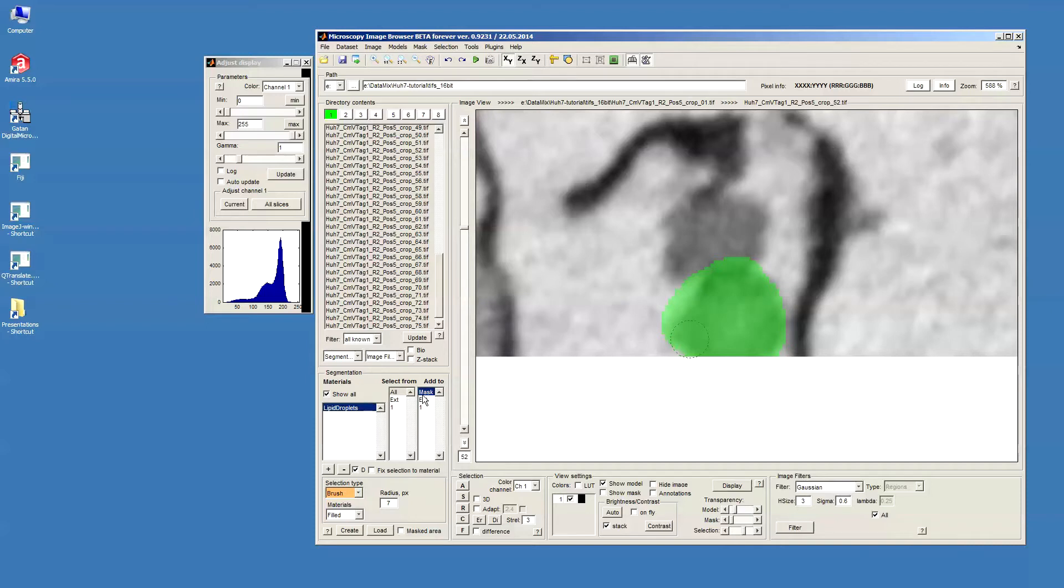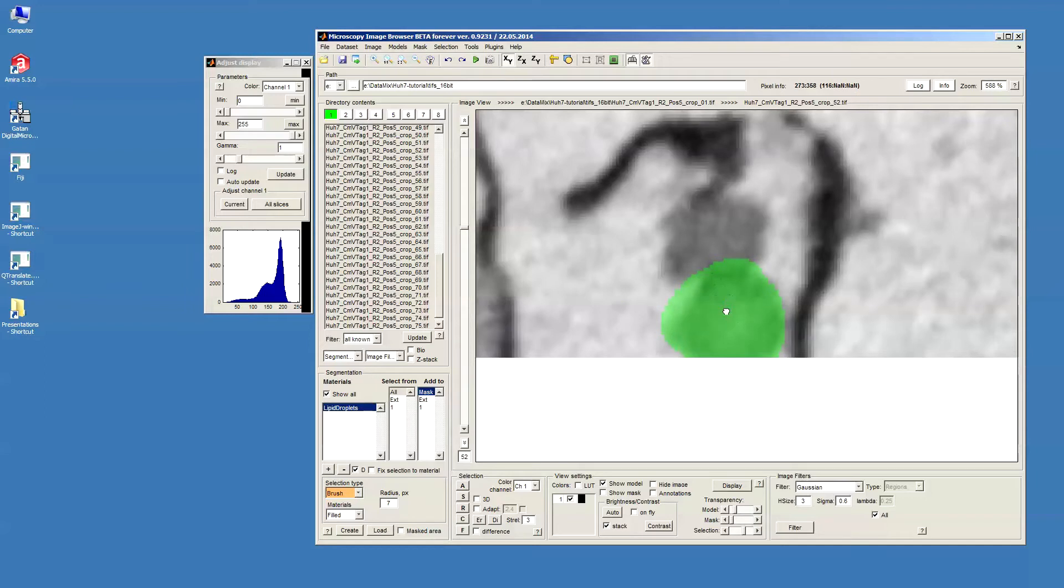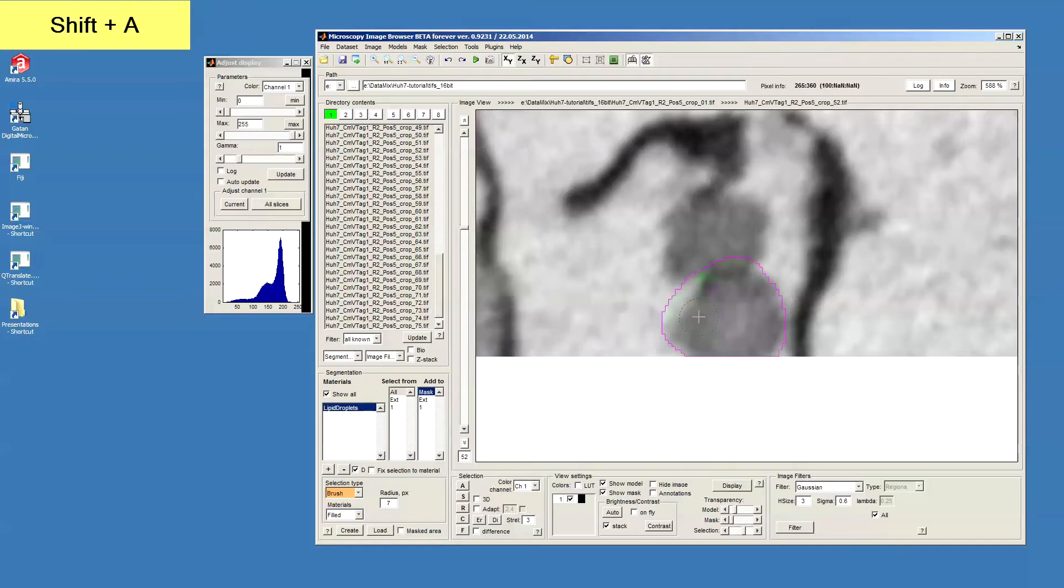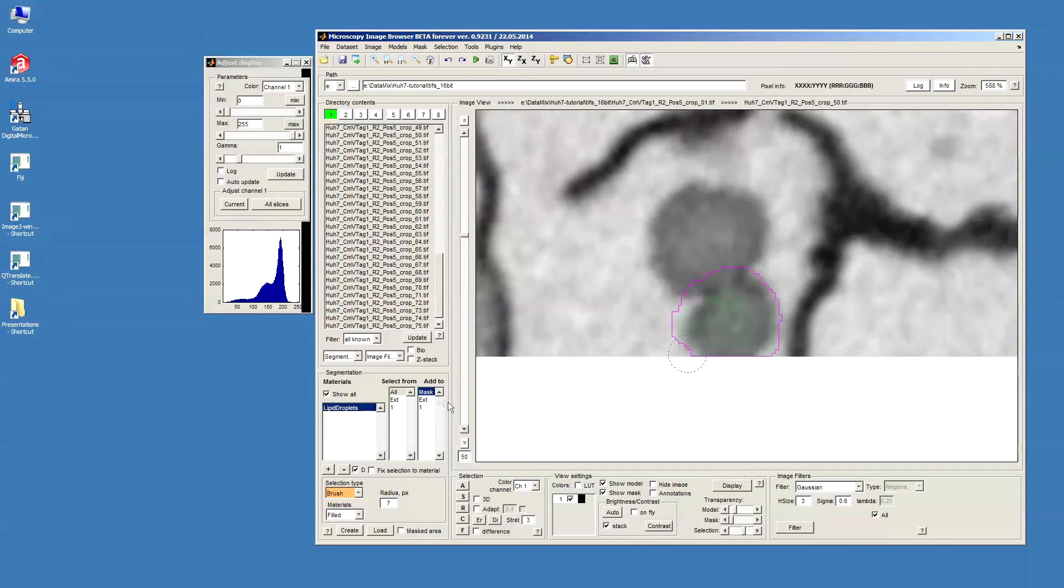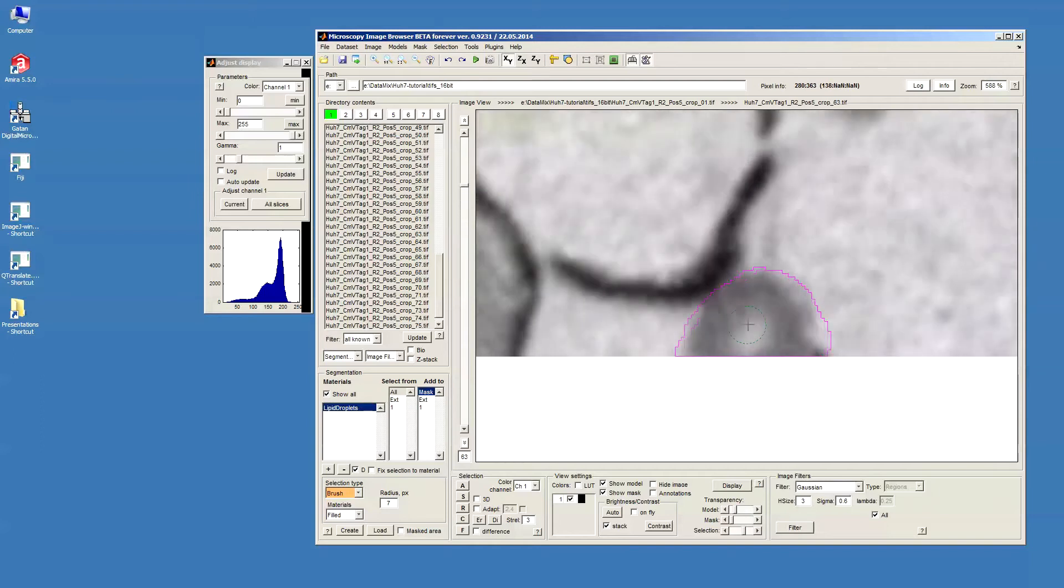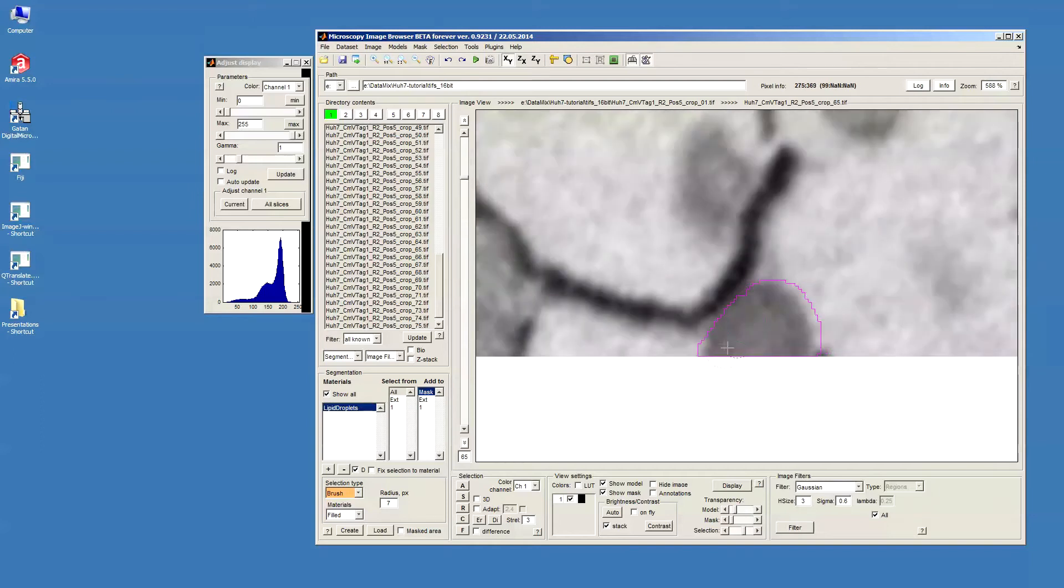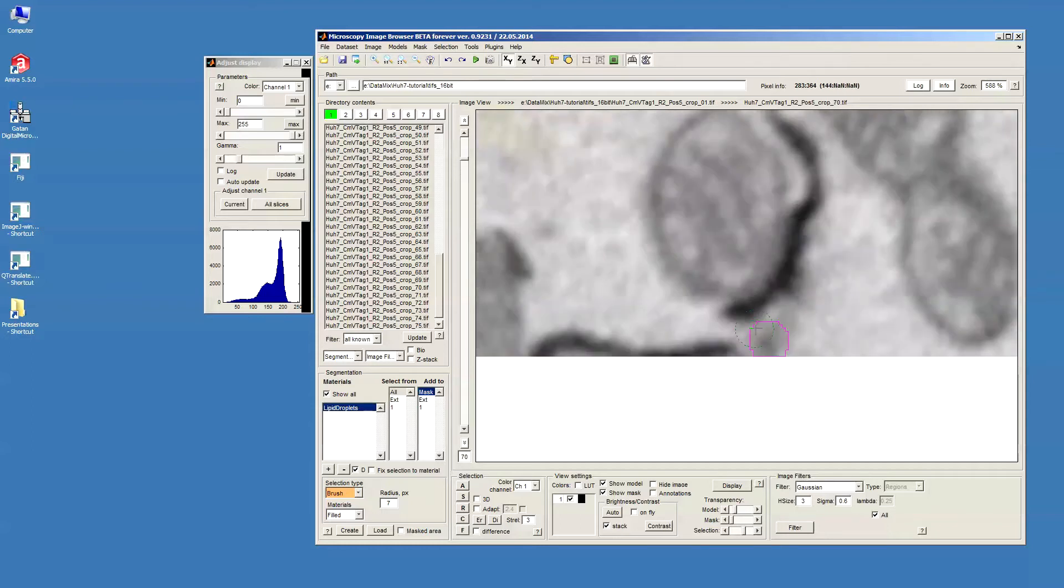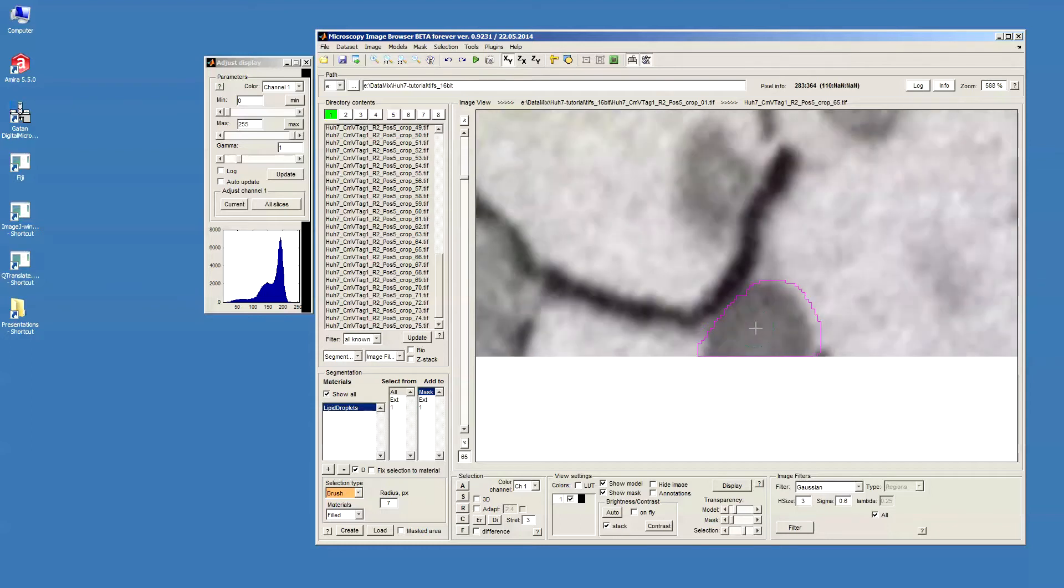So what I do is I select this add to as mask and then press Shift+A button to add my selection layer which was in green to this mask layer. So now you can see that selection, the green color, has gone and instead I have this magenta outline which specifies mask layer.